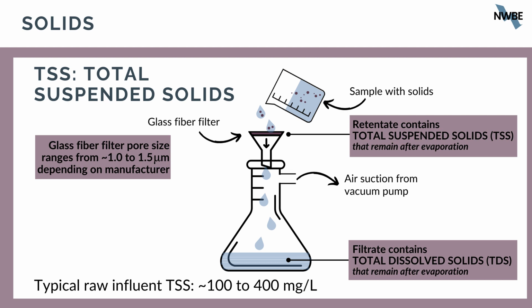And just to be clear, in an influent wastewater sample, most of the time, neither the TDS nor the total solids, so that would be the amount of solids remaining after evaporation of an unfiltered sample, is quantified. TDS might be approximated by measuring electrical conductivity, because the higher the TDS content, the higher the conductivity of a sample. And although electrical conductivity measurements may give some indication of the potential for PCR inhibition, which increases with increasing salinity, even electrical conductivity measurements are not uniformly performed for influent wastewater at all treatment plants.